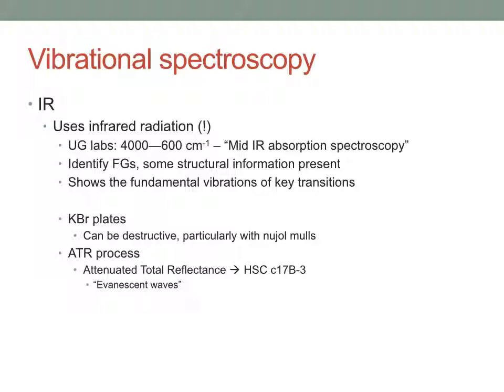Normally I discount anything below 1,200 wave numbers. So I record it 1,200 to 600. Normally I discount it. The reason being that's our fingerprint region. It's very, very difficult to interpret. It's unique for a molecule, but it's difficult to interpret. But this is kind of the 1720, we're picking out a carbonyl type scenario that we have.